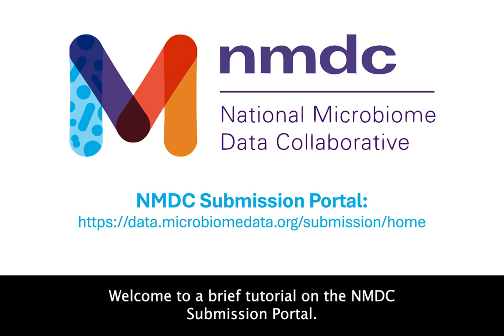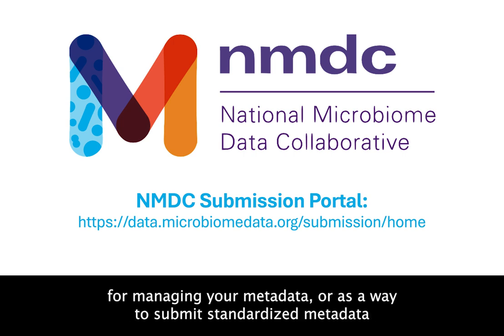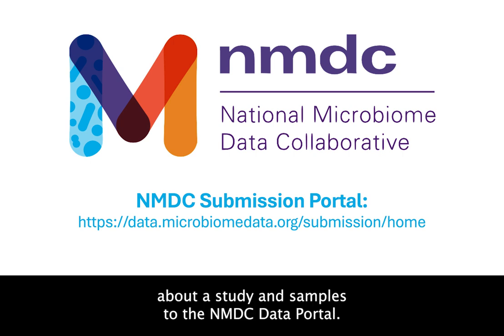Welcome to a brief tutorial on the NMDC Submission Portal. The Submission Portal is publicly available, free to use, and can be used as a standalone tool for managing your metadata or as a way to submit standardized metadata about a study and samples to the NMDC Data Portal.